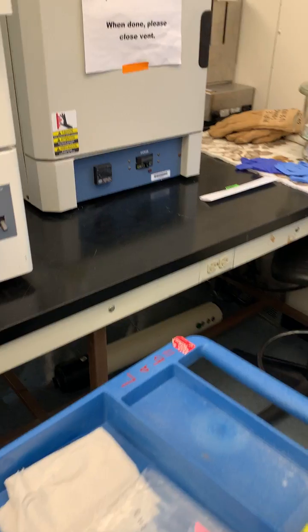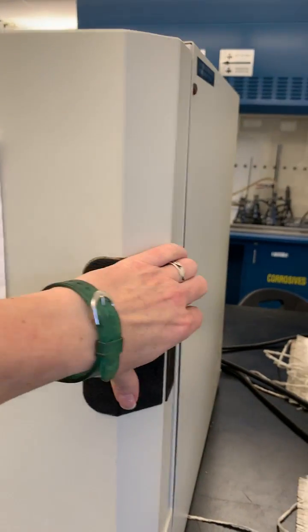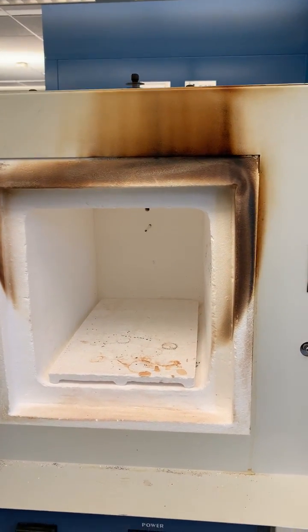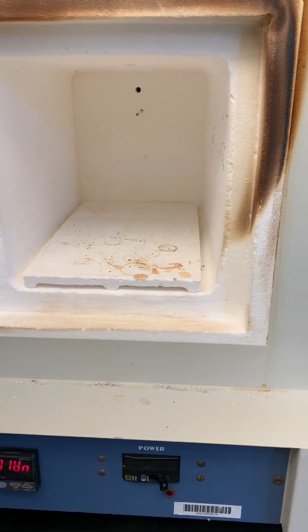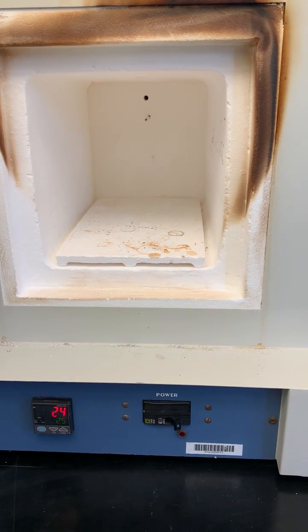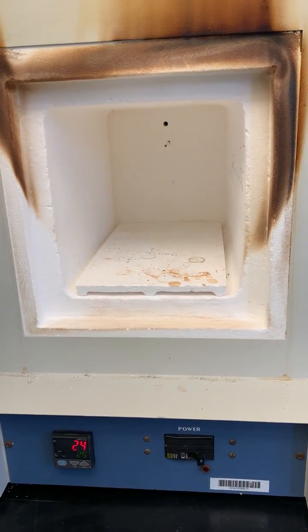Then I place them into a muffle furnace. This is a furnace — you can see it's essentially a kiln — and we can set the program at the base here, turn it on, and run it at 500 degrees Celsius for one hour, which burns the organic material off.